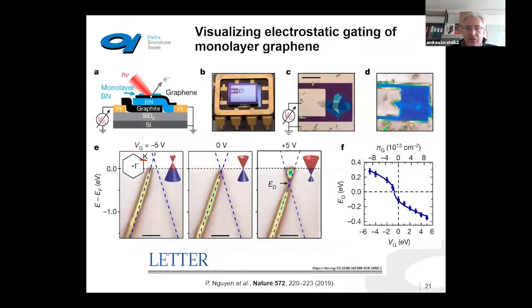And a very interesting experiment that they are doing is that they study devices under operation. Now, the trick to be able to study these devices is to start from an insulating substrate, silicon oxide, and then put, for example, two electrodes, made of platinum, on this kind of surface, and connect the material they want to study, which are typically layered materials like graphene, and apply a voltage across them.